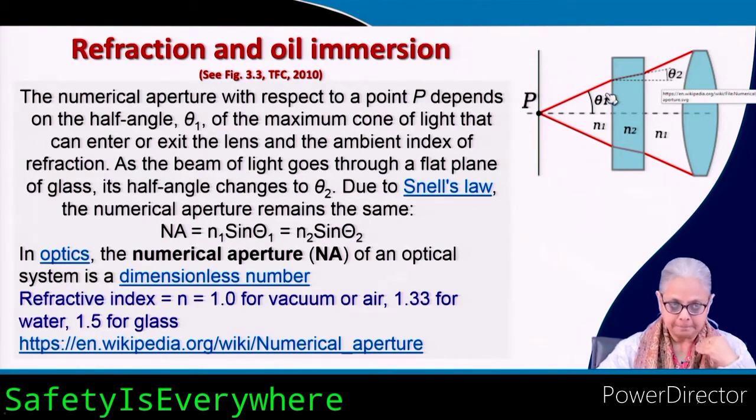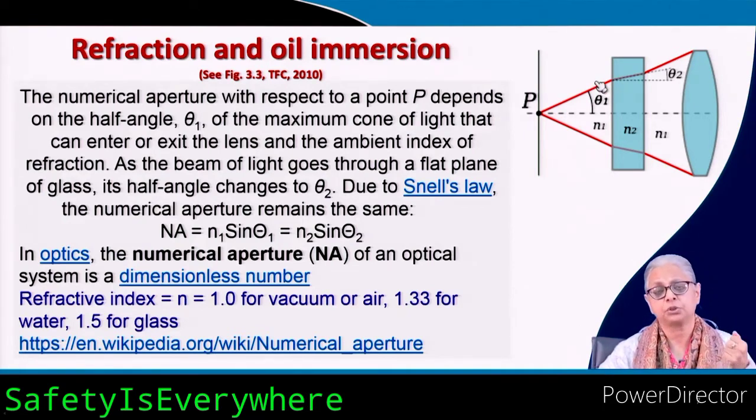Now our ability to visualize objects, especially in this kind of situation, is that the object, if it is opaque, then I can see that obviously there is some object that is blocking the light. That gives me one thing. Second, it has to reflect a color back into my eyes. If it reflects a color, then I can identify it. So either it absorbs light or it reflects light, then I can identify an object. If it passes right through, I cannot, and that's what happens with bacteria because they're practically water.